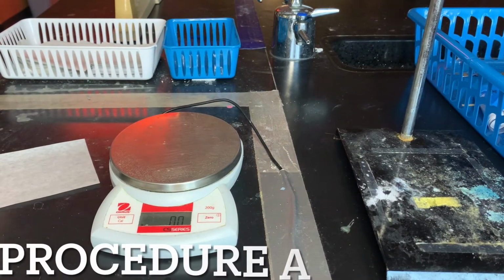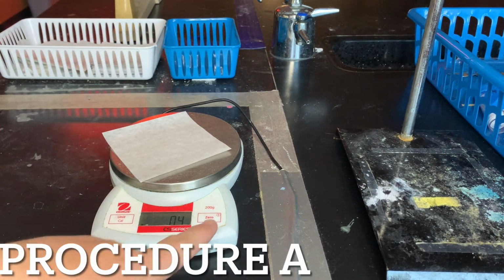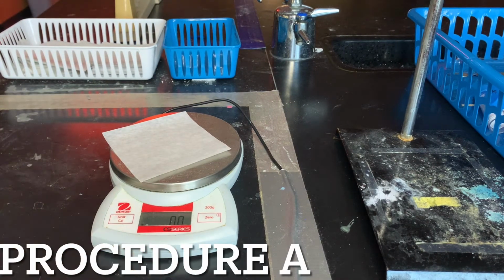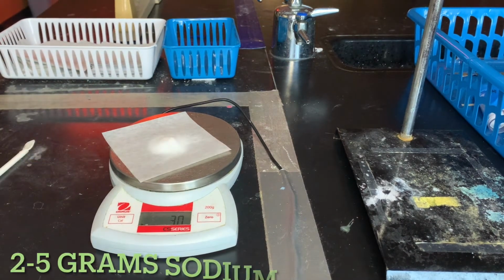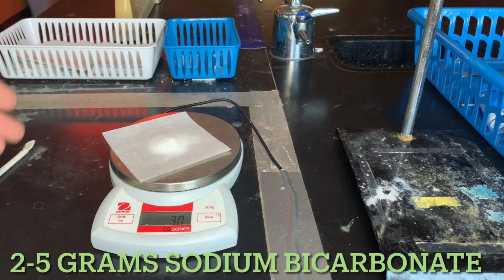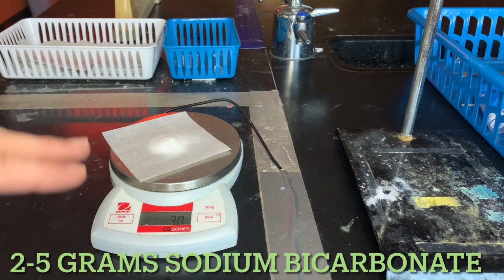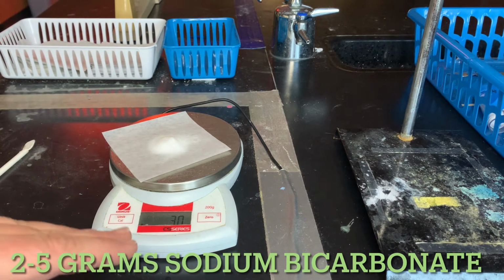So our first step, we need to acquire a substance. We're going to get our scale, we're going to zero it out, and then we're going to obtain a certain amount of sodium bicarbonate. So I'm going to recommend between 2 to 5 grams of the substance. Whatever I get for grams here, so if I get 3 grams of the sodium bicarbonate, when I do procedure B, I will get the same amount of grams of the sodium carbonate.